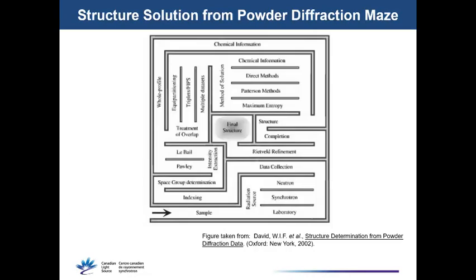So this is what's known as the structure solution maze in powder diffraction. To get through the maze to the final structure, there are a bunch of steps that you have to complete in order, and there are decision points where you make choices which can be the difference between success and failure as you're doing this.